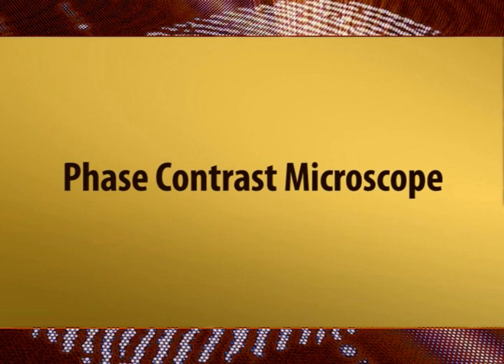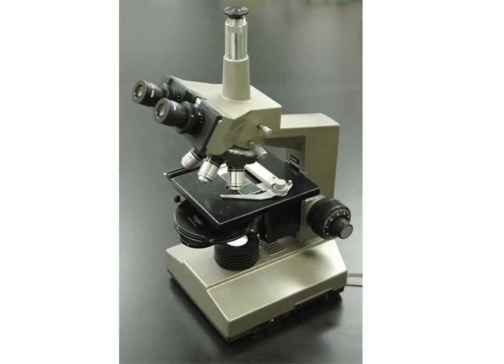Coming to the phase contrast microscope. Phase contrast microscopy is an optical microscopy illumination technique in which small phase shifts in the light passing through a transparent specimen are converted into amplitude or contrast changes in the image.